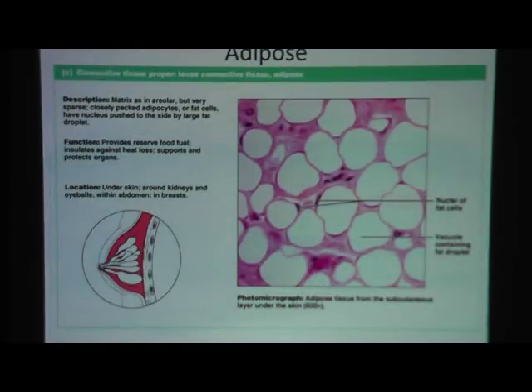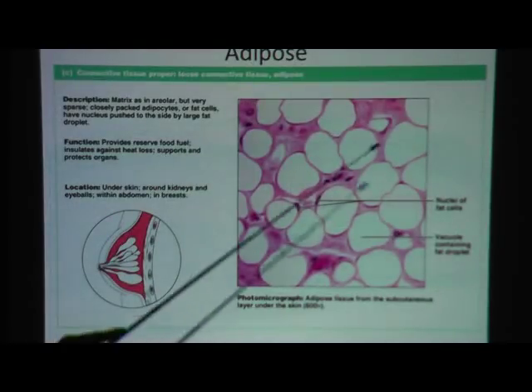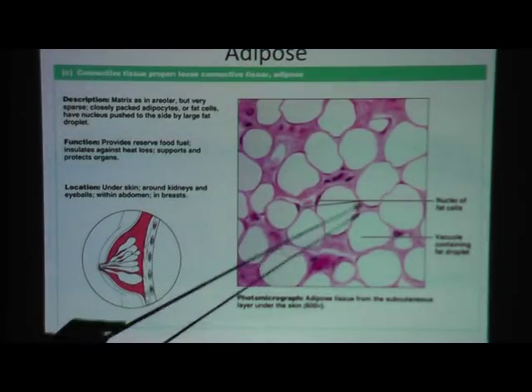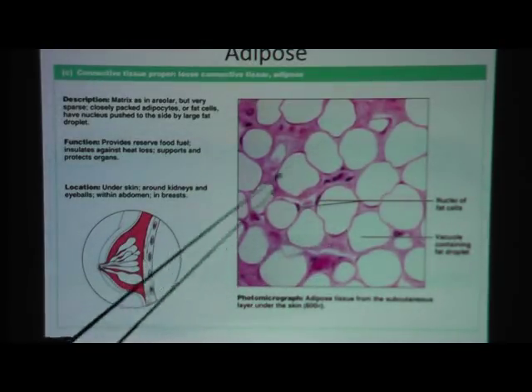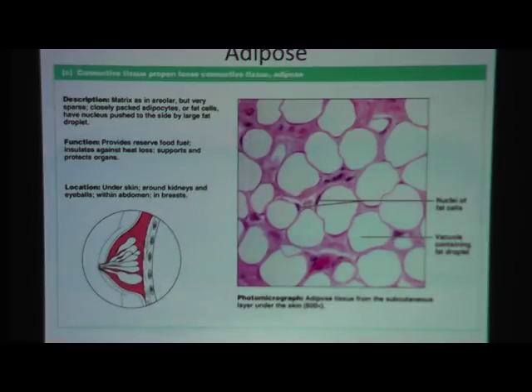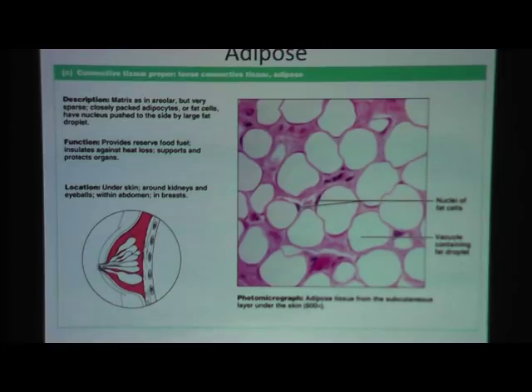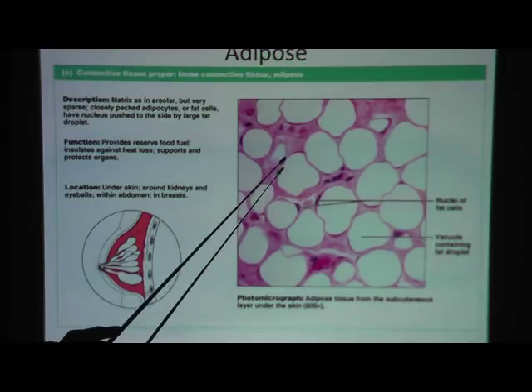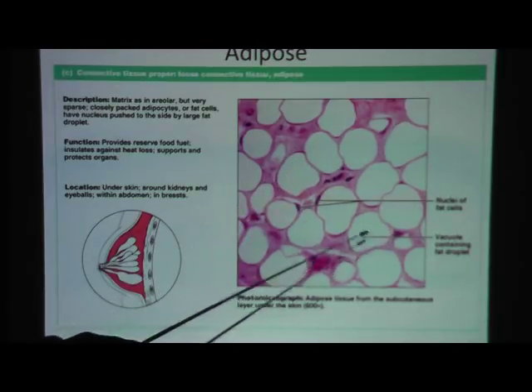This is a picture of adipose tissue. Adipose is fat. As you think about fat cells, you would expect them to be round in shape — and indeed they are. They live up to their name; these are round cells.